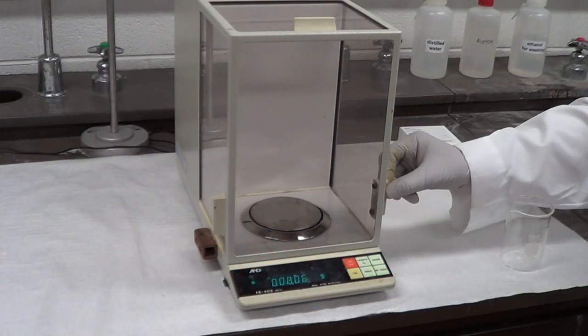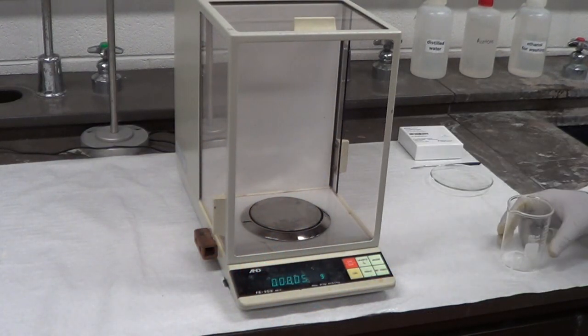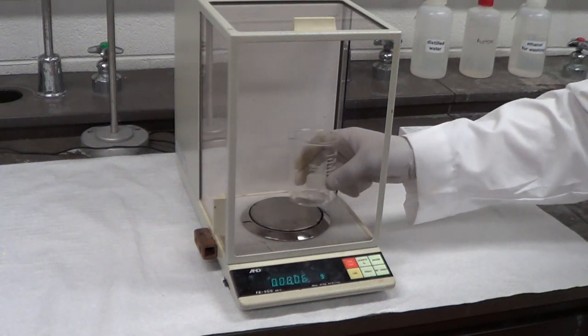Before we start our chemical reaction, we will use measuring balance to record the weight. We will place the beaker on the measuring balance.